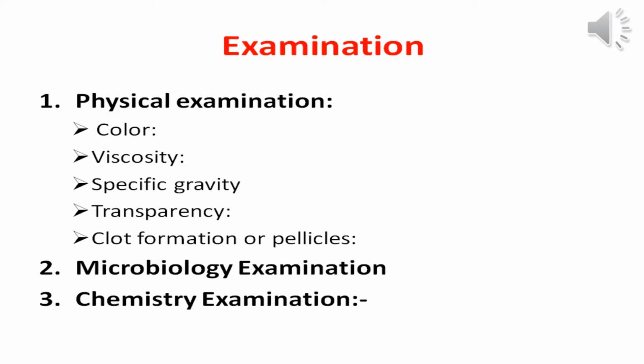You can see the CSF yellow. If you remember, newborn babies always have problems with jaundice, and the bilirubin is high. If you take a CSF sample from a newborn, I may find the CSF yellowish. Also in a pathological condition you can see the CSF bloody. Bloody may be due to two reasons: injury by the needle that was used to collect the sample, or brain hemorrhage, which is bleeding in the brain.